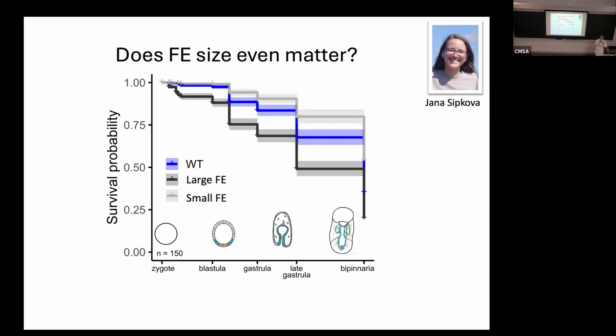These are the same experiments with calcium and magnesium concentrations that make larger and smaller envelopes. These are our experimental settings right here. Does it matter how long you exposed them to the calcium?